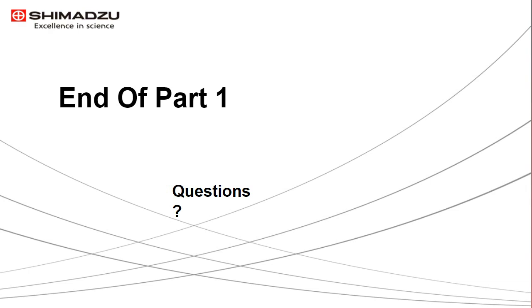All right, thank you. The second question, we do have time for a few questions, so we'll go with the second question. Why would you want to measure specular samples with a sphere rather than a dedicated specular reflectance accessory? This is actually an excellent question. Normally, one would use a dedicated specular accessory because that's what that accessory is designed for. And I mentioned that you can make hotspots in a sphere with the specular sample.